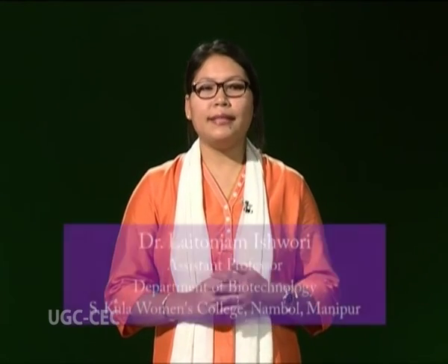So that was about the media for the growth of bacteria. And to sum up today's topic, bacteria, in contrast to fungi, are often cultured in media used in the routine bacteriological laboratory, which are composed of constituents like beef extract, which is a derivative of beef and is a source of organic carbon, nitrogen, vitamins, and inorganic salts, and peptone, which is a semi-digested protein. Hence, for the successful cultivation of a given microorganism, it is necessary to understand its nutritional requirements and then supply the essential nutrients in the proper form and proportion in a culture medium.